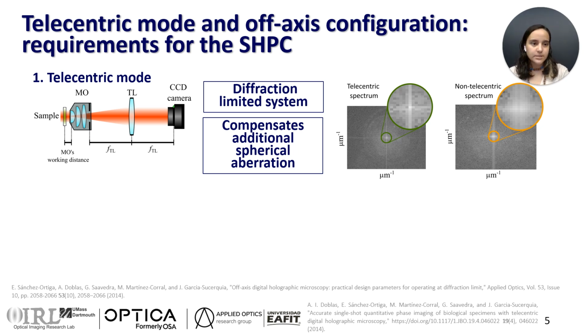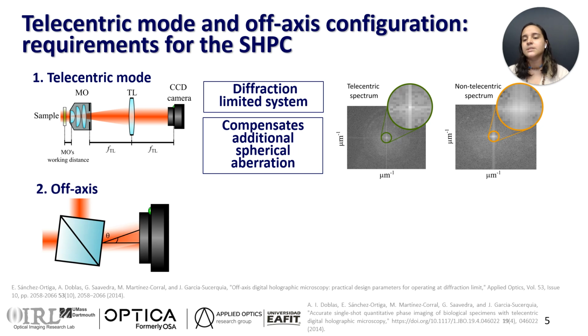There's no overlap between them, so we can perform easy spatial filtering to recover our information, the one from the sample. So the core of our proposal is to find the correct spatial frequencies that lead to the best compensation.